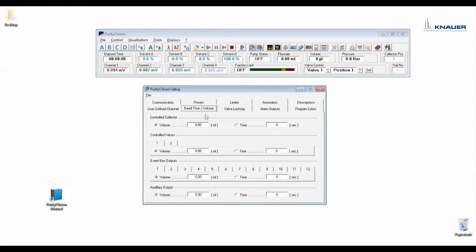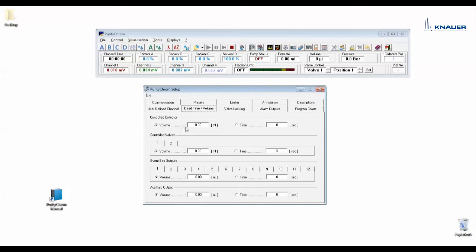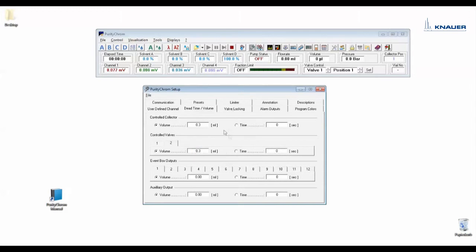Under dead time or volume you have to enter the delay volume. The delay volume is the volume between your fraction collector and your UV detector. Just to keep in mind, if you use a fraction collector for fractionation you have to enter the volume under controlled collector and for the fraction valve as well. I would not recommend to use time because if you create your method based on volume or column volume it would be too complicated to calculate the exact delay volume.